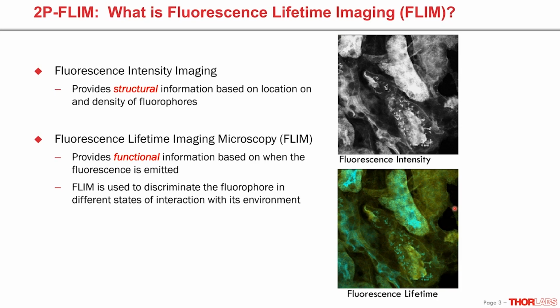The second image below is a pseudo-colored representation of the same tissue in the same fluorochrome. And as you can see, there's a significant difference in the lifetime of the fluorescence, which shows on a point-by-point basis and shows different metabolic states within the sample. The FLIM image allows us to distinguish different environmental conditions on a pulse-by-pulse basis at any given point in time.